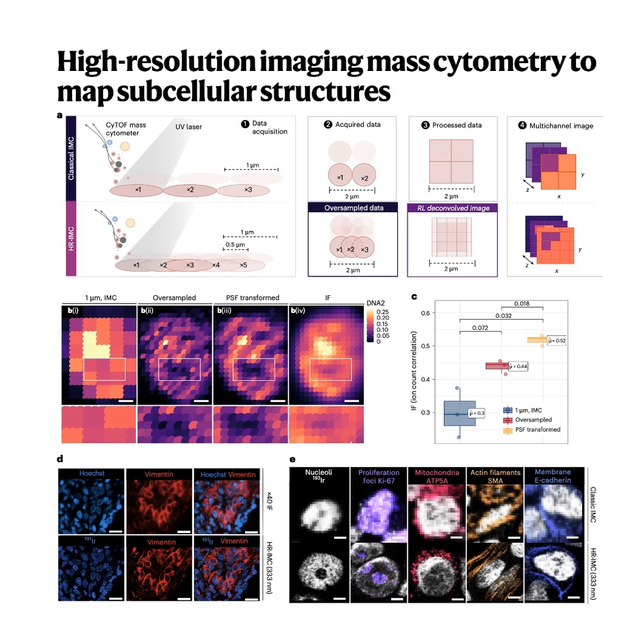Okay, so a tiny amount of energy. A tiny amount. It allowed the underlying signal in that region to actually survive multiple overlapping passes. They're sort of chipping away at the tissue, not blasting it. Right, but that creates a new variable, doesn't it? The tissue that was already hit by a previous shot is going to contribute less signal than fresh tissue. Exactly. The signal decays with every single pass. So to make the math work, they had to create a predictive model for this signal loss. They described it using an inverse sigmoidal loss function.